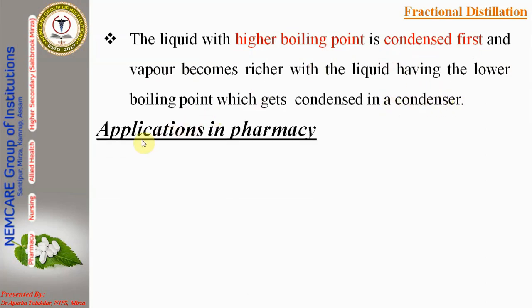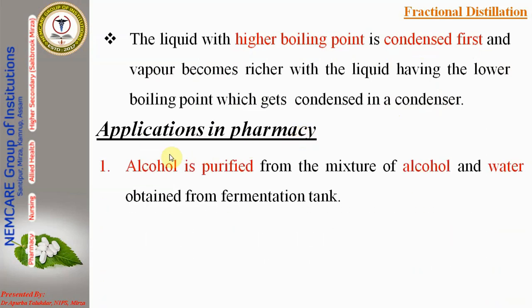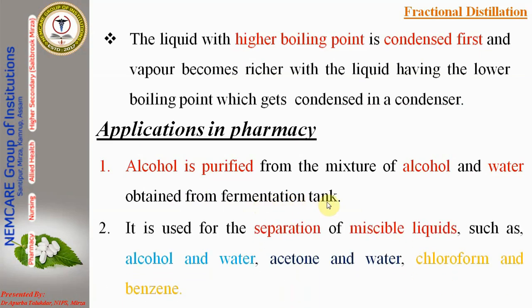Coming to the applications in pharmacy of fractional distillation. Firstly, alcohol is purified from a mixture of alcohol and water obtained from the fermentation tank. Next, it is used for separation of miscible liquids, when there is a mixture of alcohol and water, or acetone and water, or chloroform and benzene, that can be separated by fractional distillation. Okay, let's see a video which will describe all the details about the instrument.